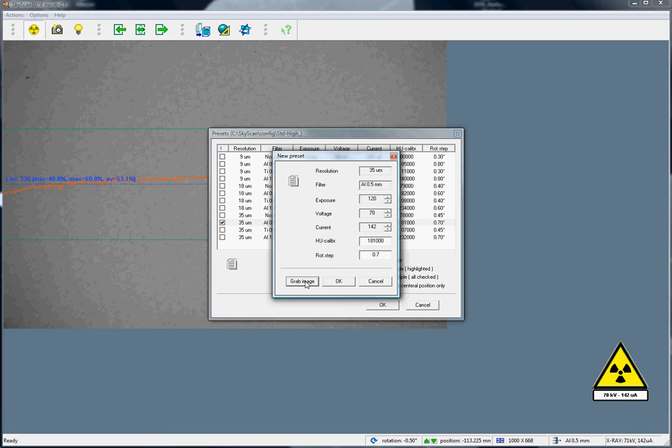You may appear to do so, but in fact, an incorrect exposure value can result in saturation and damage to your camera.